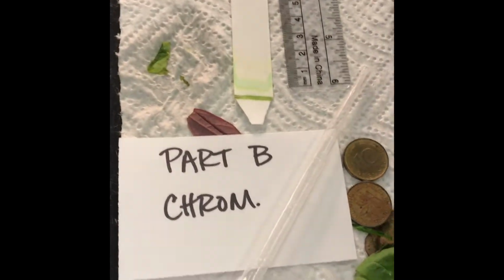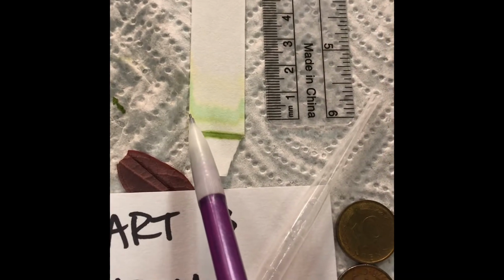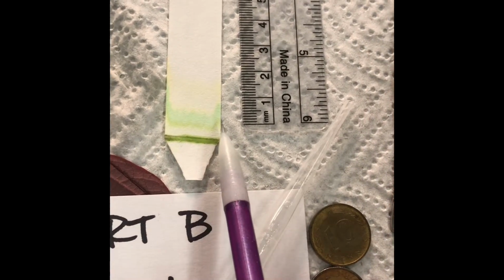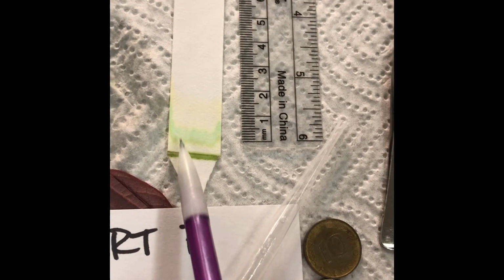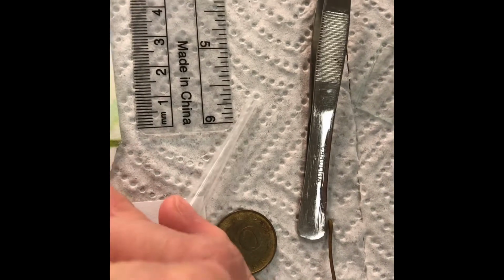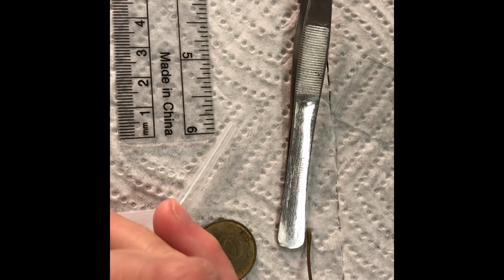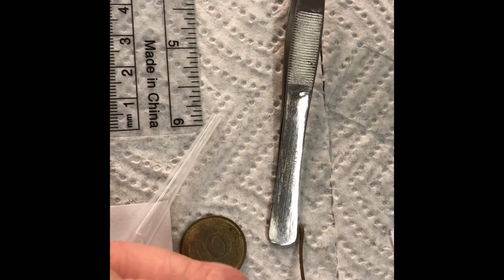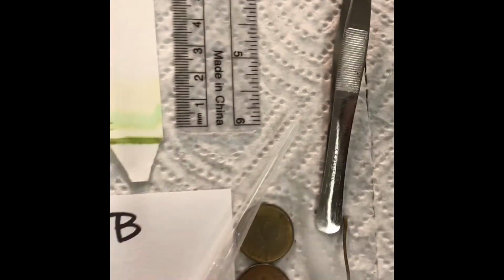Okay, now the fun part, you guys get to take your pencil here. I'll show you the first one, then you can do the other ones. You can see this different color green right here at the bottom compared to that more bright green. That is 2 different pigments. So you want to mark the base of the first one, and then we want to mark the base of the second one, which is kind of like right there. Okay, you see that? And then you can see another pigment.